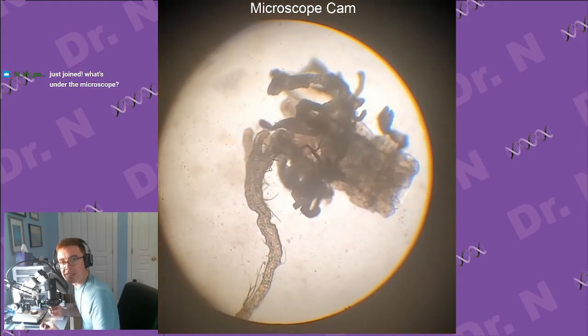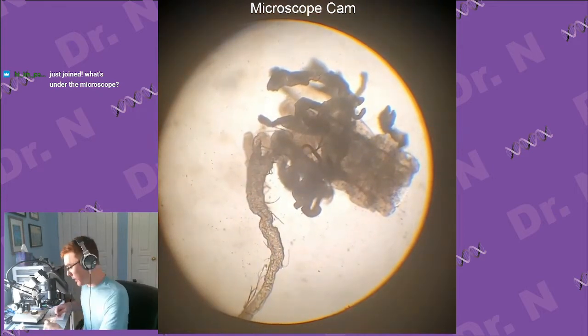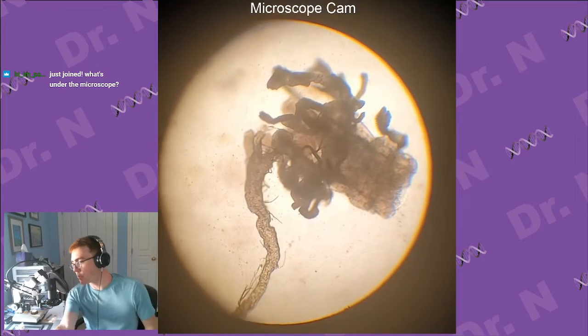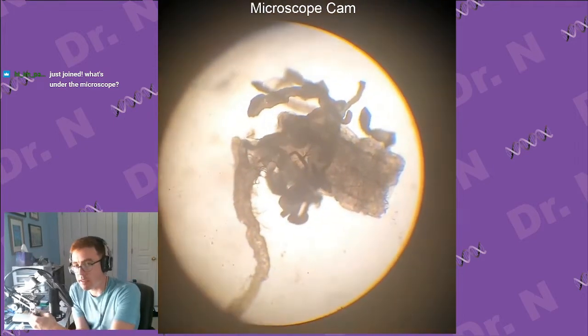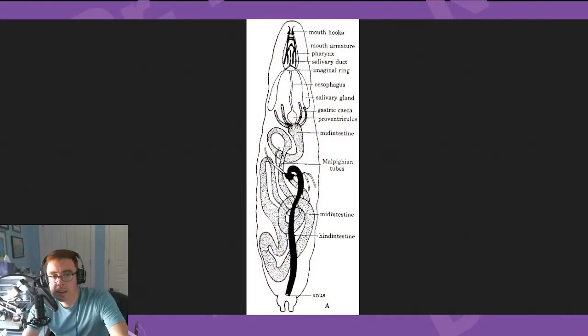Hi, Paul. So what I'm looking at, actually, let me just switch quick to another screen. It won't go away. So I've got a fruit fly larva. Right now we're looking at kind of the upper half of it because I've cut it through this midsection and turned it inside out.